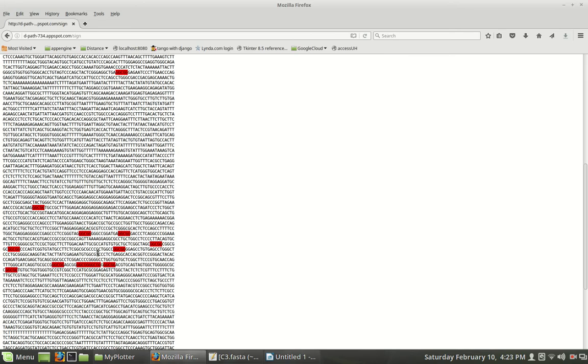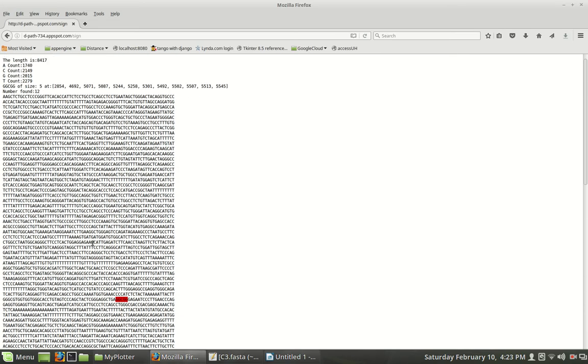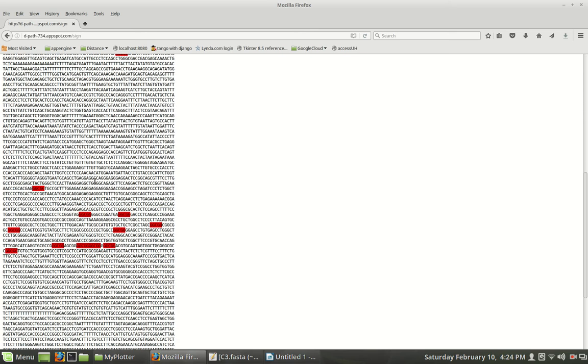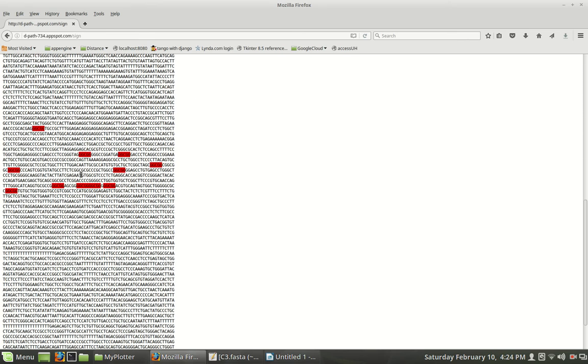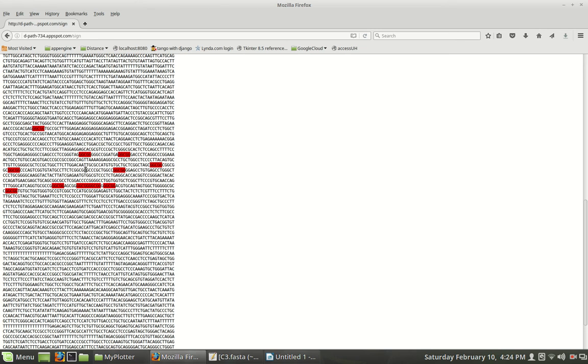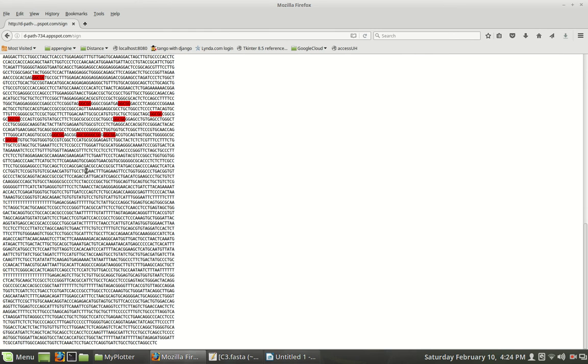So this particular region in here looks to be around 5,500. That's a little late for a transcription start site. So even though it's a little late for the promoter and to get the transcription start site in this one, I would look a little earlier. Certainly the first one is not the right one. Later on you might look around, but one of these is probably it, and I'll let you try and figure out where you think it might be.